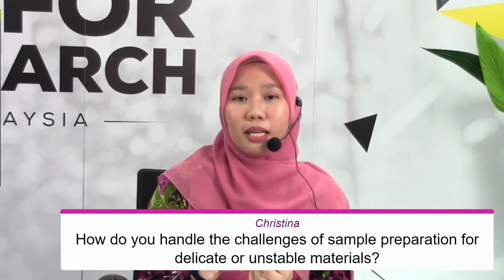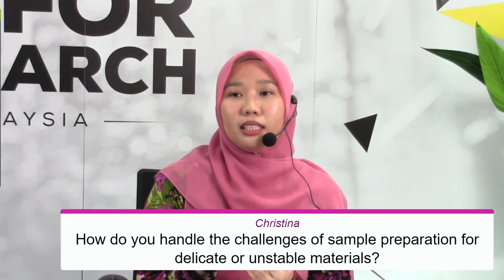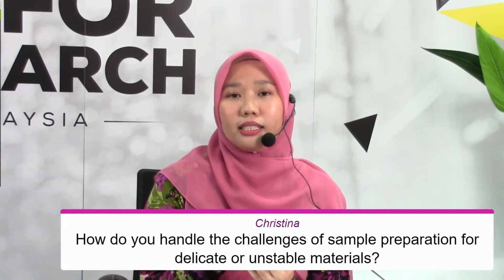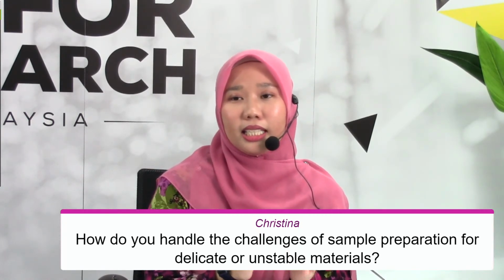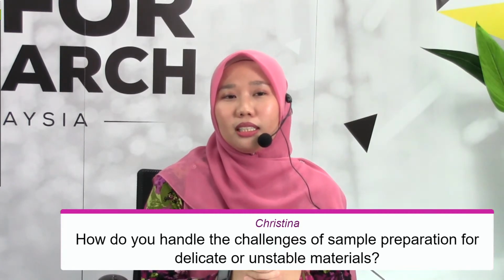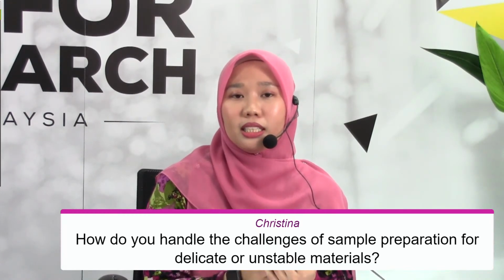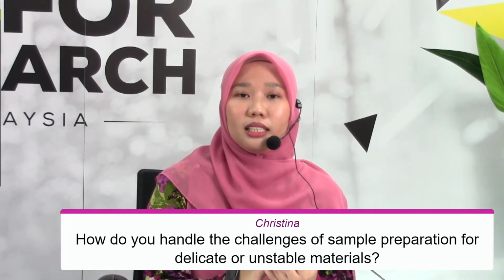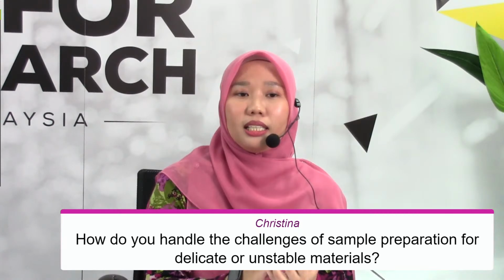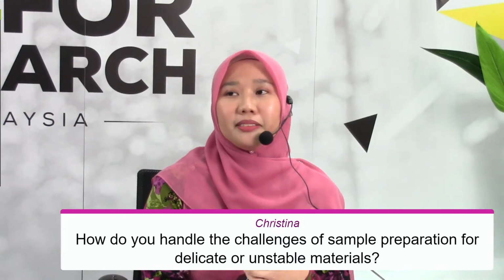before we start to prepare our samples. Usually the first is the fixation, because we want to see as much as possible the true condition of the specimen as in living specimens. So that's why we have to consider the pH of the sample, the homeostasis conditions, the temperature, and what the compound of the specimen is. Thank you.